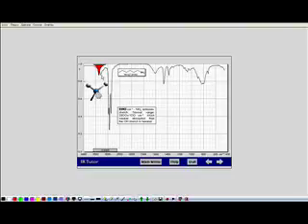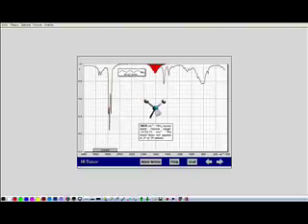Now, one of the reasons why I gave you all these example spectra is because you have a stack of spectra that you're going to match the compound to the spectrum for homework, and it might be helpful to go through and look at these particular shapes, because you may find in the homework problems a spectrum that has that little doublet pair. Well, if it has that, then it is most likely the NH2. Okay? So you're going to want to look over these spectra as you go through the homework. But there's the asymmetric stretch, there's the symmetric stretch. Then there's bending and everything else.